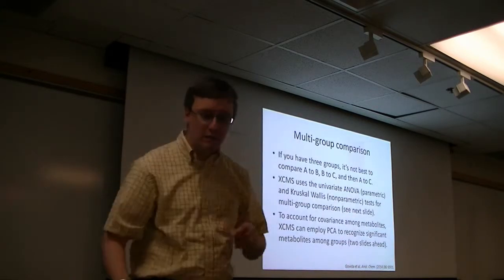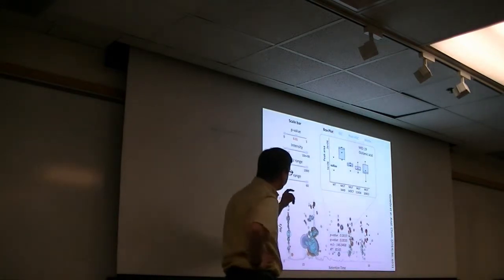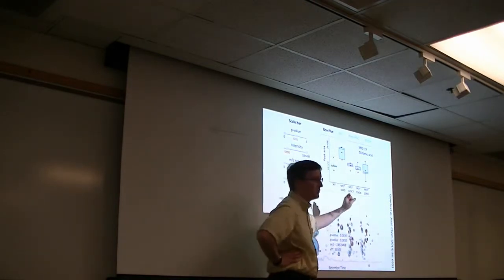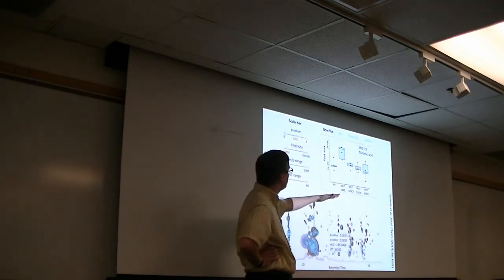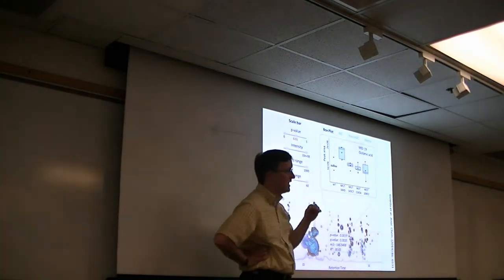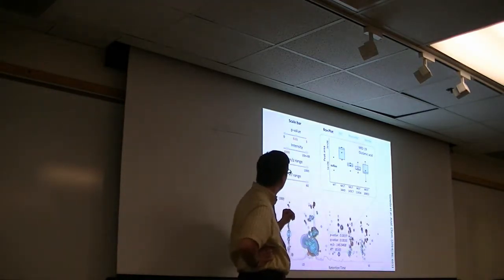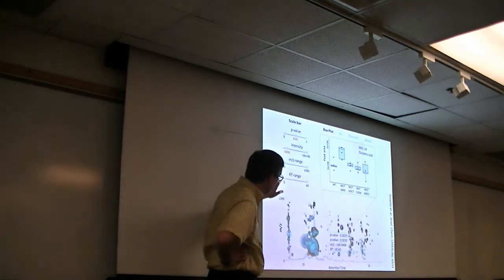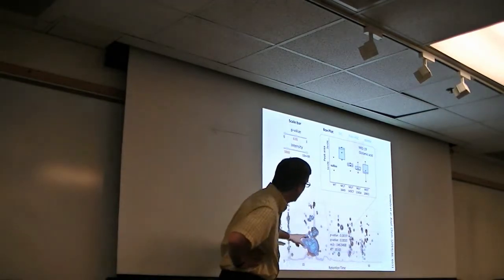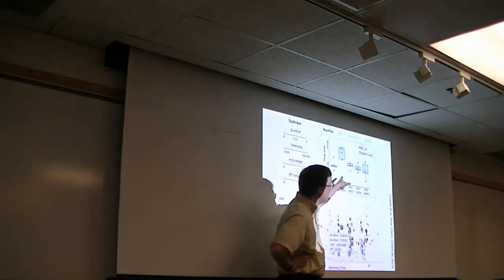All right. So I'm showing slides of these, and here we go. This is the ANOVA example. So we have a sample type that can contribute. We've got 5 different samples that can come into play. And we can look at individual metabolites, in this case glutamic acid, to ask how the measurements of this particular metabolite vary across these. And we can see that we're getting p-values out of these. Now this is kind of a half a cloud plot, basically. So we can evaluate which ones have p-values, and by that, pull this out.